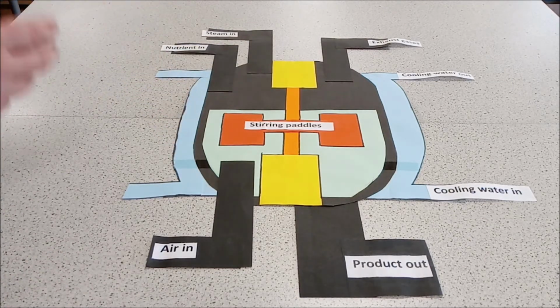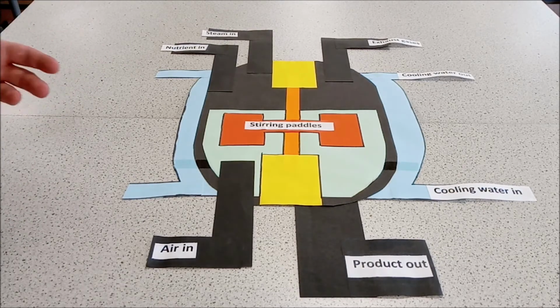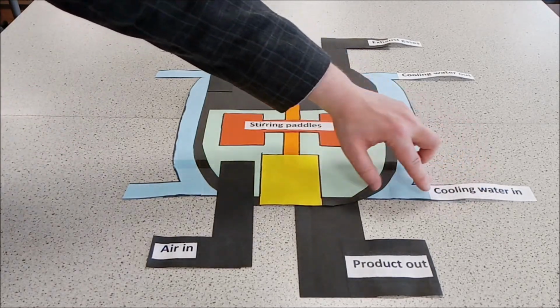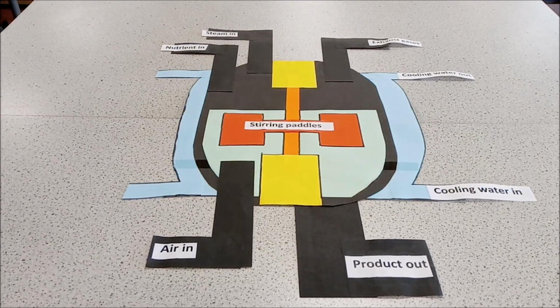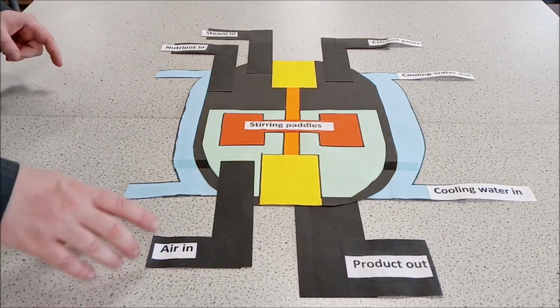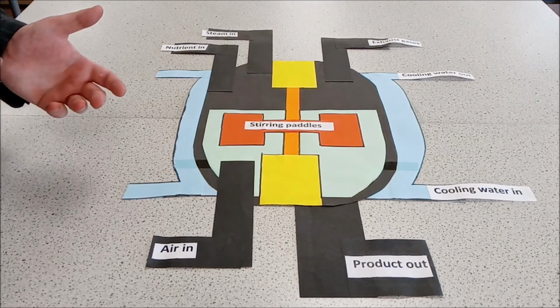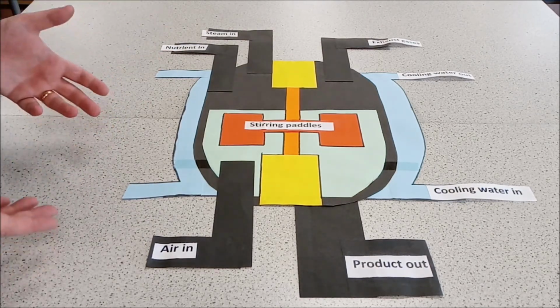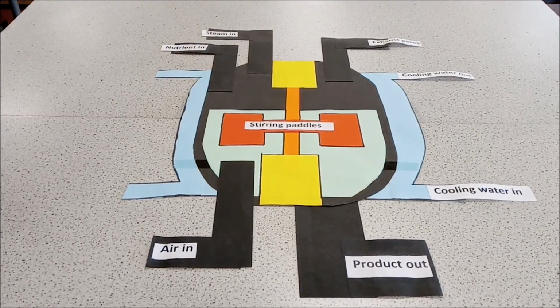Ask them about what's going to happen to the fusarium if it gets too hot. So you can talk about things like the enzymes within them might become denatured and so forth. And that leads them on to why you need this cooling jacket of water, which helps maintain the temperature. If we're talking about what else we need for respiration, so we've got air in, you can talk about what gas is needed out of the air in order to increase the rate of respiration. So they need to think about the oxygen.